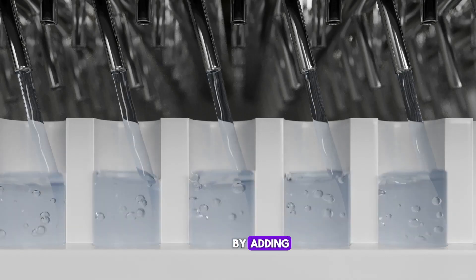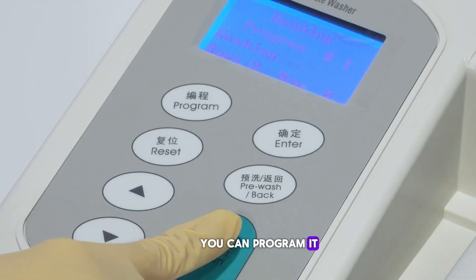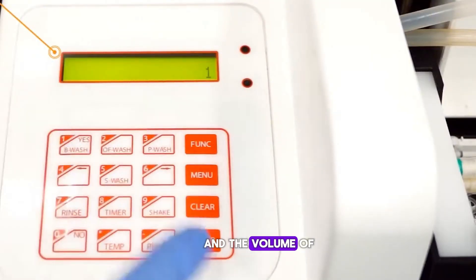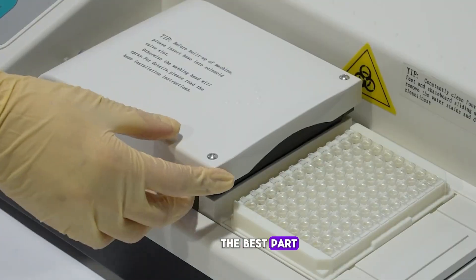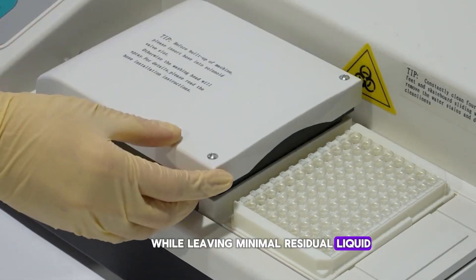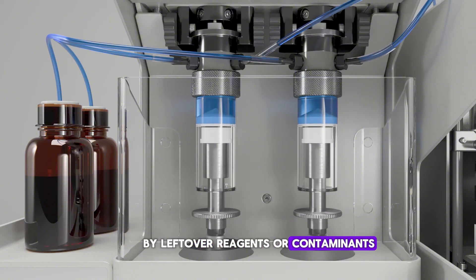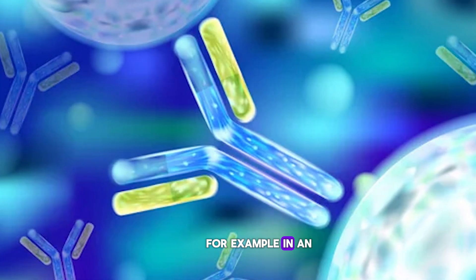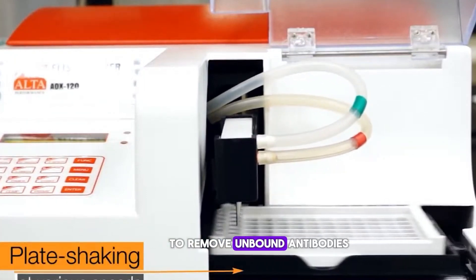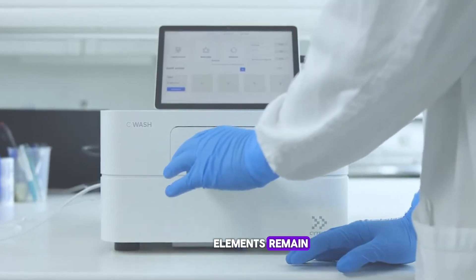How does it work? The microplate washer operates by adding washing and aspirating liquid from each well. You can program it to adjust the number of wash cycles, soaking times, and the volume of liquids dispensed or aspirated. It does all this while leaving minimal residual liquid, so your assays aren't compromised by leftover reagents or contaminants. For example, in an ELISA assay, the microplate washer will rinse out wells to remove unbound antibodies, ensuring only the bound elements remain for accurate readings.